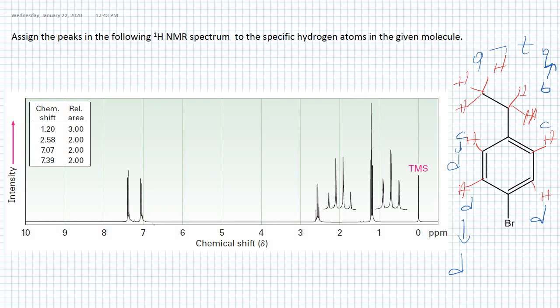Okay, so it's very easy for this part because you remember the downfield of spectrum, around between like 6.5 to 7.5. Generally aromatic protons appear here, so I will say that one of them is D and one of them is C hydrogens. But which one is which?